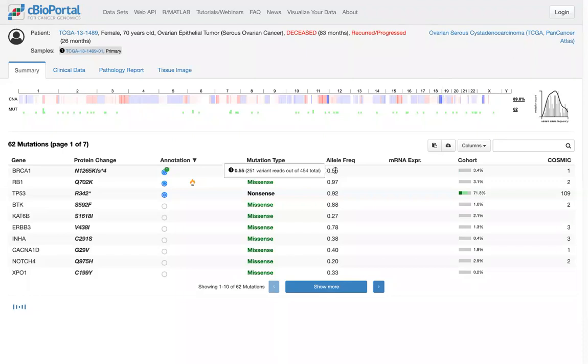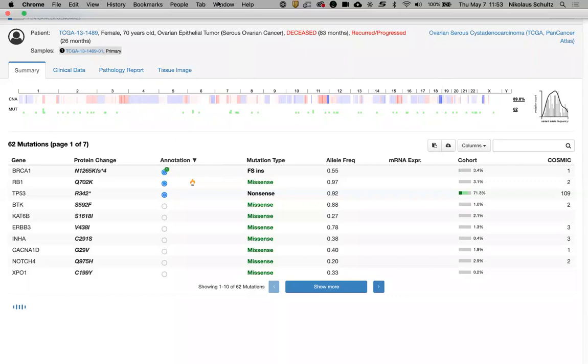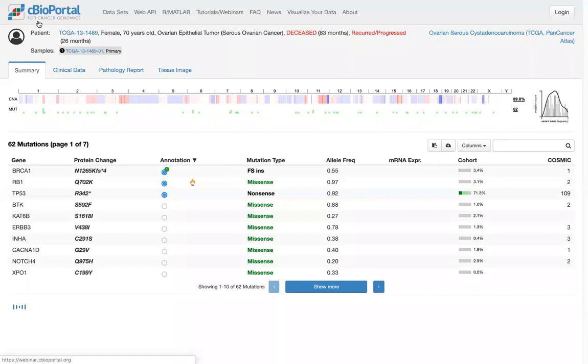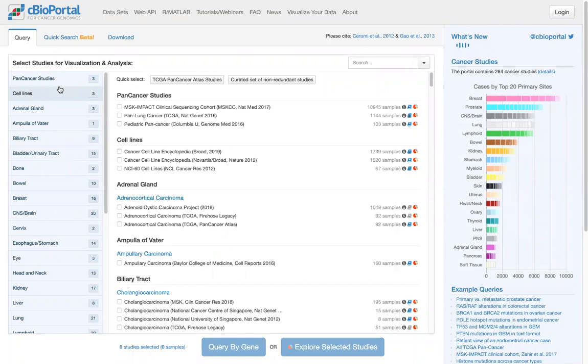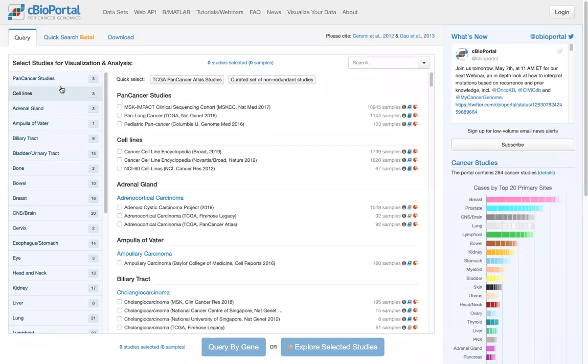The germline example just shown — that information is really as provided by the study. That's not something we're making any calls about. If a study annotates something as germline, then we annotate it that way. There will be very few studies with germline information, and certainly not a single study that will have germline information in all genes in all samples.